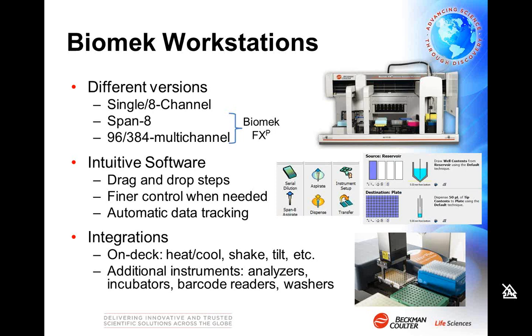However, the work I'll be showing today was actually performed on the Biomek FXP, shown to the right. And this actually has 2 heads. In our case, it has one Span-8 and one 96-channel multi-channel head on the left. All 3 platforms share the same intuitive software.